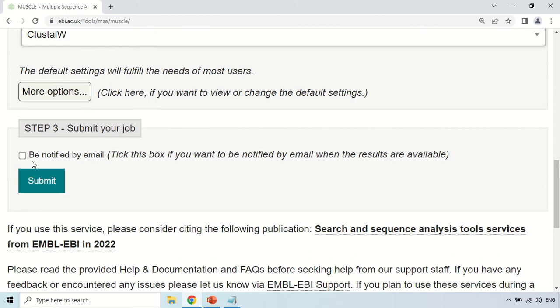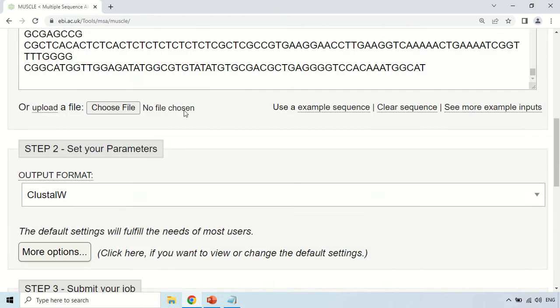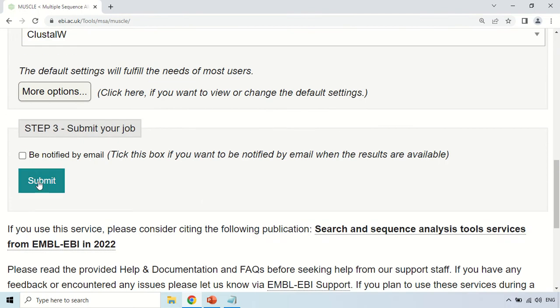Now, under the submit section, there is an option 'Be Notified by Email'. If you click here, you can enter your email address. The tool will send you an email containing the link to your results, because sometimes processing takes time — so you can give your email and relax. Under the title section, you can choose a title for this particular job. Now, after pasting your sequences and choosing the output format, finally click the submit button.